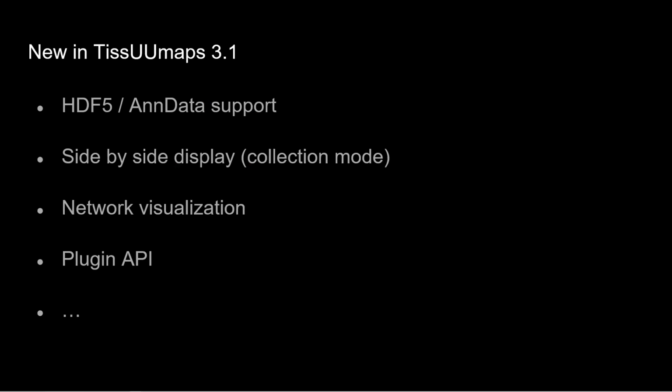We also have network visualization, so graphs. If you have graphs on your data that come from Squidpy or from anything else, then you can display the edges directly on your data. And we also worked a bit on the plugin API. I will not talk about that today, but if you have questions about the plugin API, you can contact us. And we are working on adding that to the documentation also, so that it's simpler to use.